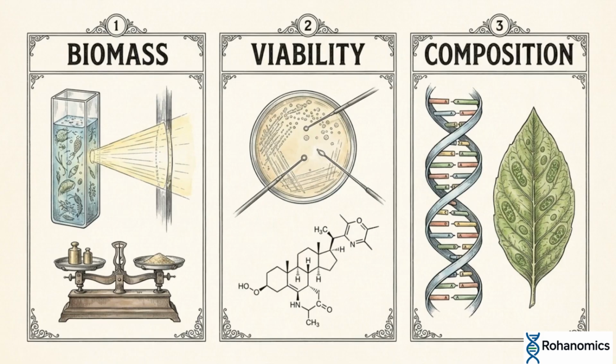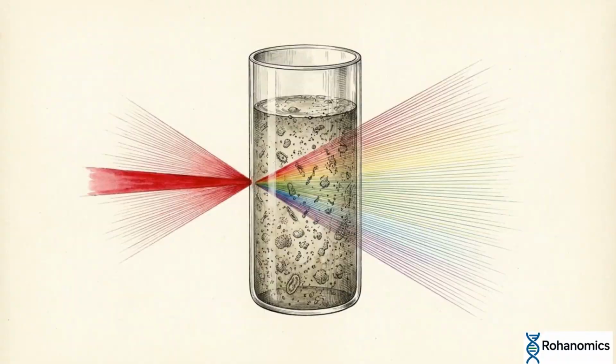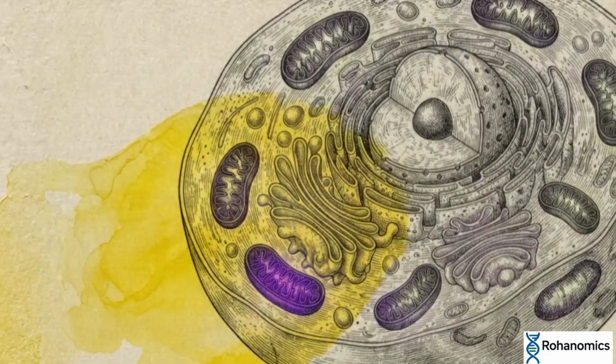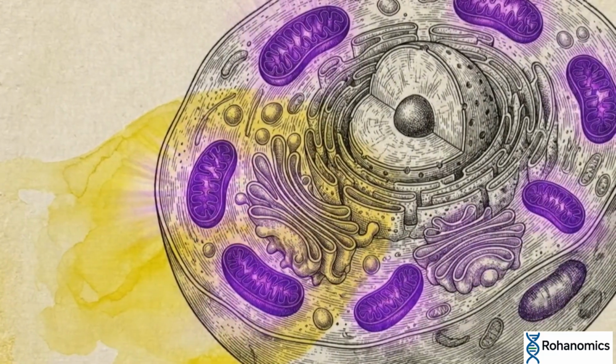Precision requires matching the distinct biological question to the correct proxy. If a process only demands the total yield of a culture, you rely on the physics of light scattering and the Beer-Lambert Law, or the measurement of dry weight. If the protocol dictates you confirm active life, you leverage biochemistry, utilizing dyes that only react to the metabolic activity of mitochondrial dehydrogenase.